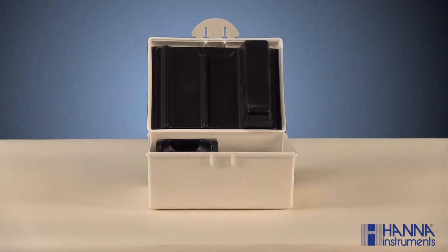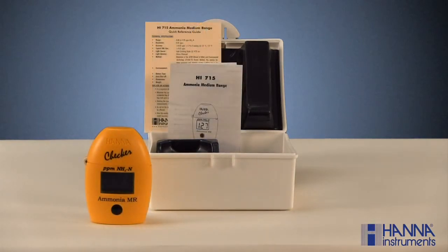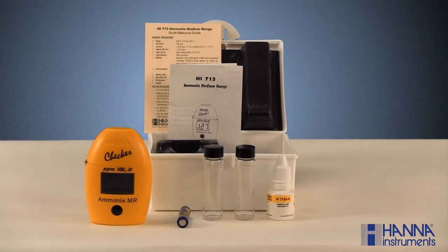Ammonia is an important parameter in agriculture, hydroponics, and aquaculture. With the HI-715 ammonia checker, you should have received a carrying case, the checker, an instruction manual and reference guide, one AAA battery, two 10 milliliter sample cuvettes with caps, a bottle of HI-715A-0 ammonia reagent, and a bottle of HI-715B-0 ammonia reagent. If your kit is missing any of these items, please contact our customer service department.